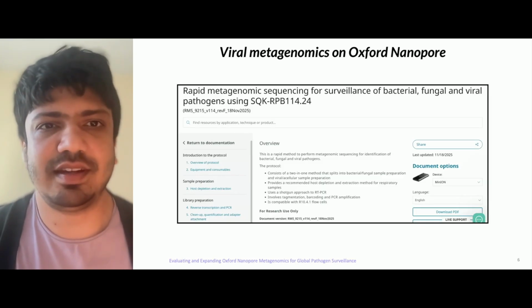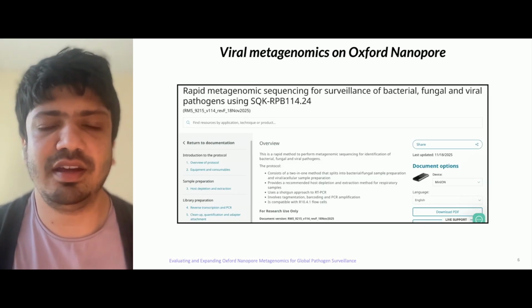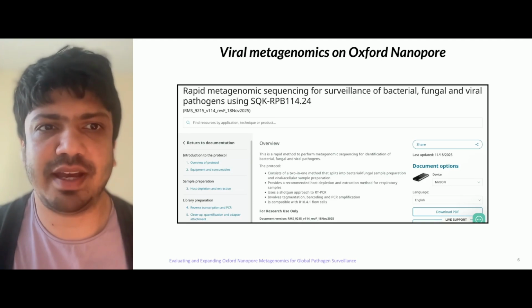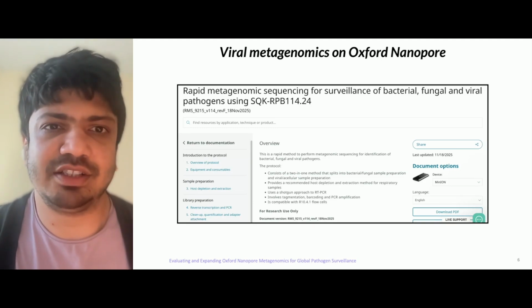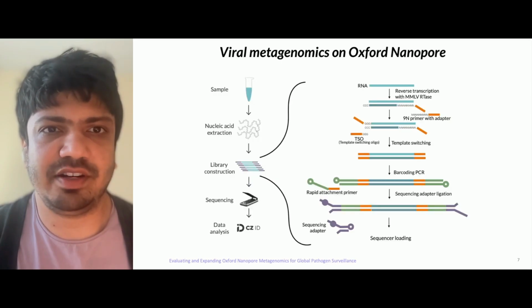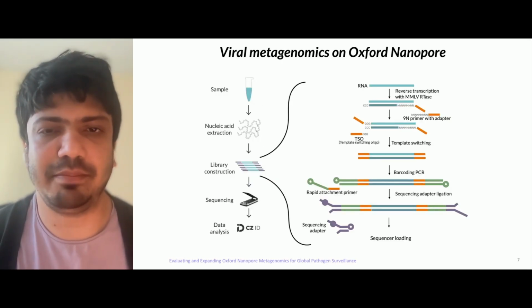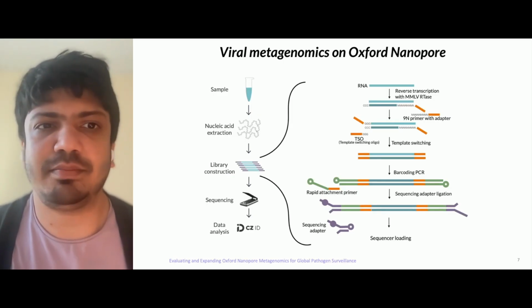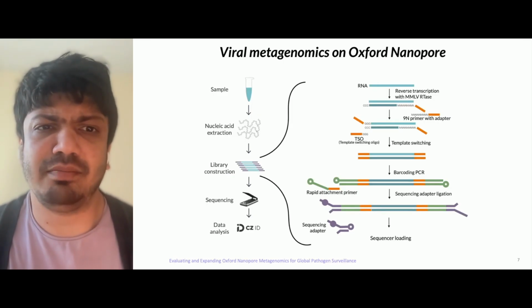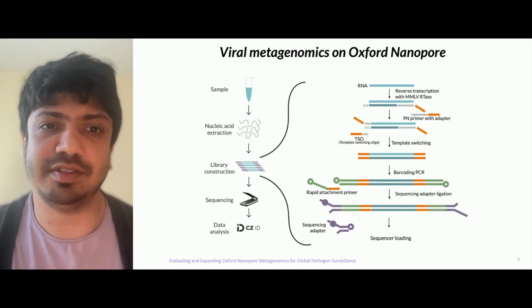So this is just a screenshot of the protocol that you can find on Oxford Nanopore's website, and I'll just go over it real quick, focusing mainly on the library preparation part. Some of you may be curious about the extractions, and in general, we tend to recommend whatever extraction method you have been using.